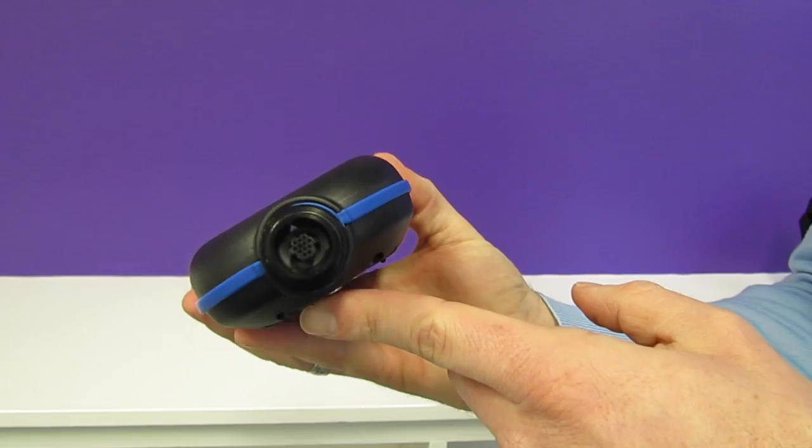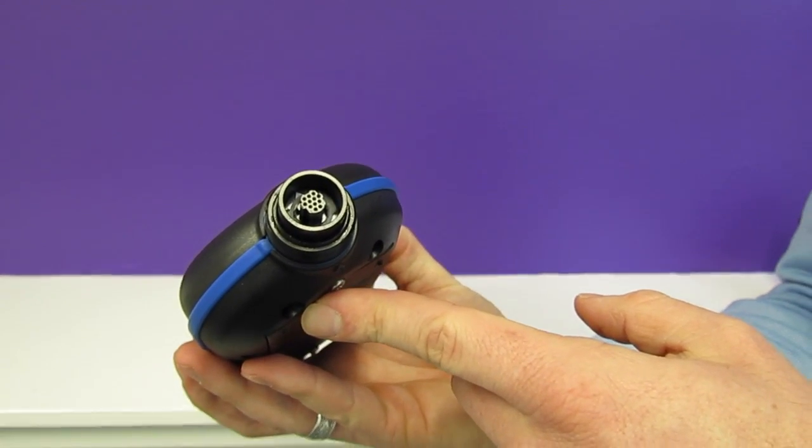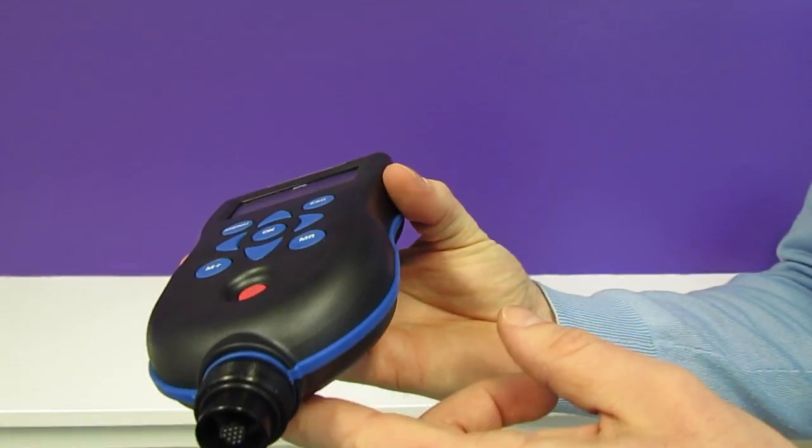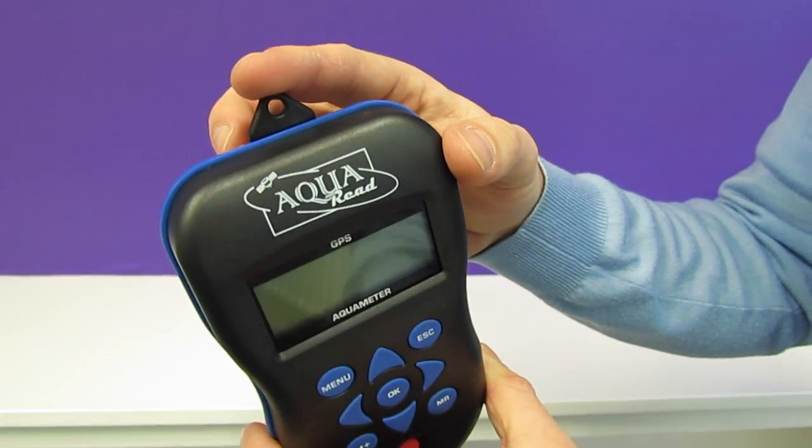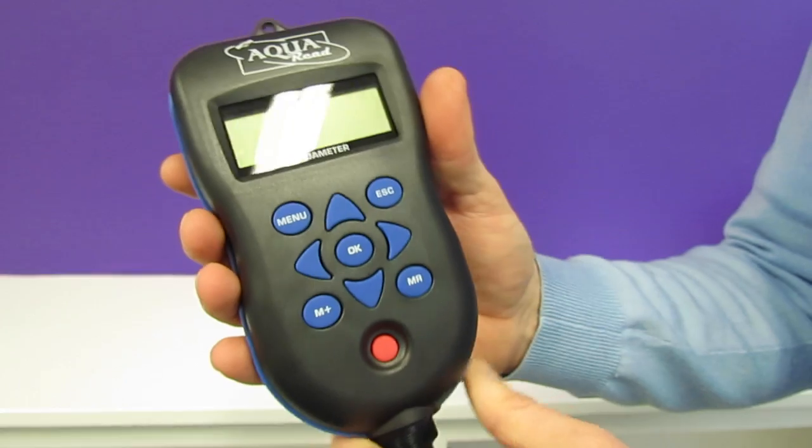The meter also features one of our metal connectors, which is very strong and rugged for use in the field. It also has a lanyard clip to allow you to fasten the meter around your neck so you don't drop it into the river.